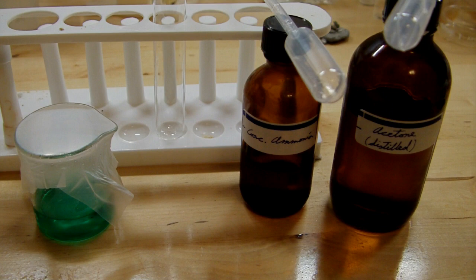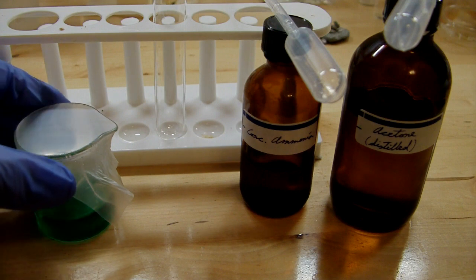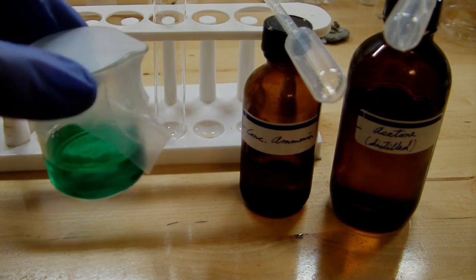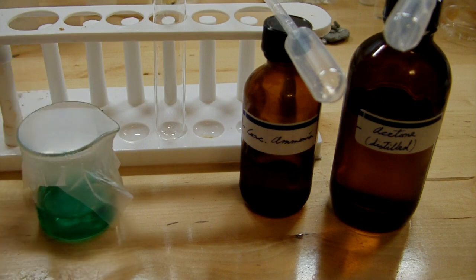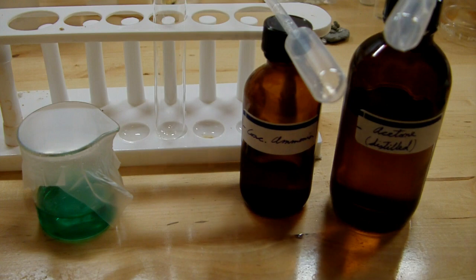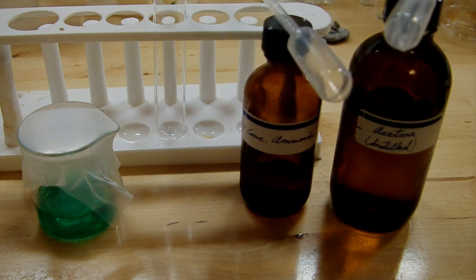It's actually very simple to make. It's a complex between nickel chloride and ammonia. So all we need here is a concentrated solution of nickel chloride, nice emerald green, and we're going to combine that with concentrated ammonia solution and acetone, which I distilled in my previous over-the-counter purification video.